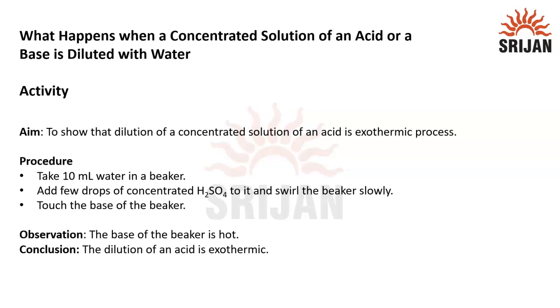What happens when a concentrated solution of an acid or a base is diluted with water? Let us see this with the help of an activity. We are showing that dilution of a concentrated solution of acid is an exothermic process. Exothermic means a process in which energy is released. And dilution means simply adding water.